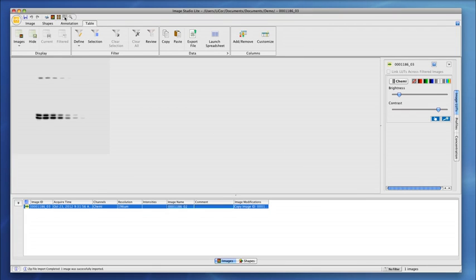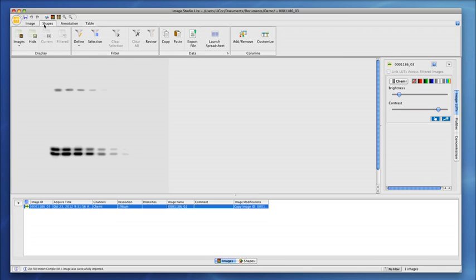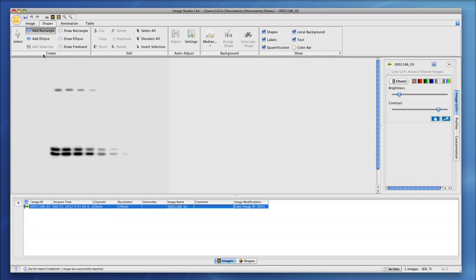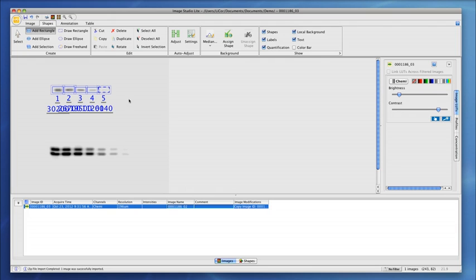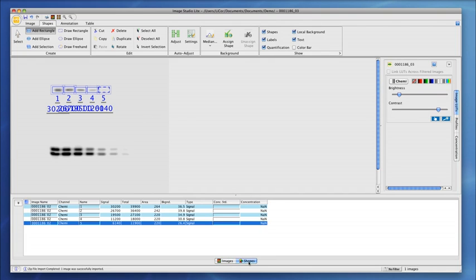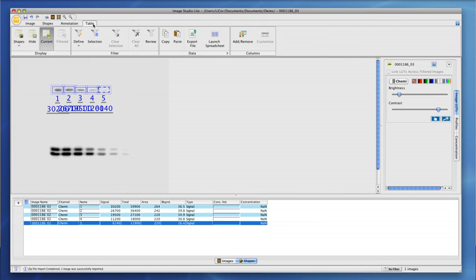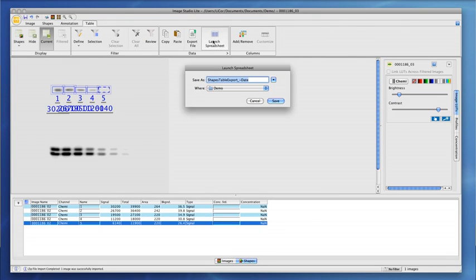and remember, local background is automatically subtracted. Finally, export your data to a spreadsheet.